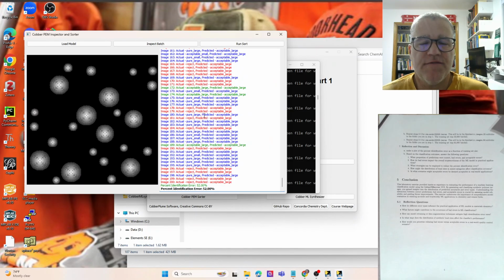Now in the final lab here, we will go back to convolutional neural networks, and we will really hit this idea of overfitting, and we'll actually see the consequences of overfitting. So we haven't been able to see that yet in our labs, but in the last lab in the sequence, that will arise for us.